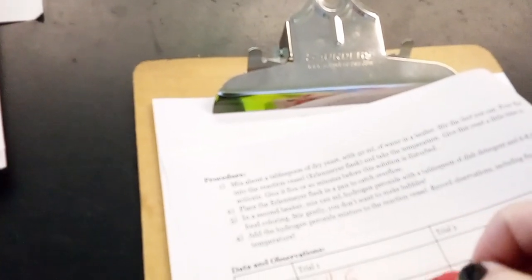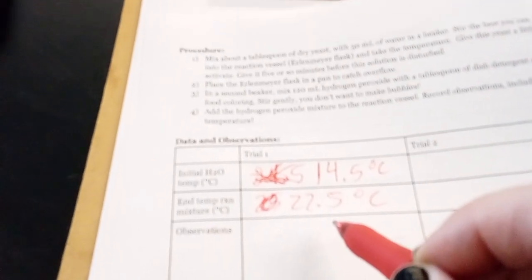Now I want to apologize because that was not the initial temperature, it was not 24.5. The initial temperature was below the 15 mark, so it's 14.5. That was the temperature initially, so fix that. It's not 24.5, just cross it out. It was 14.5. The temperature rose to 22.5.